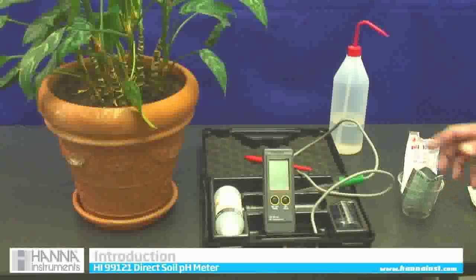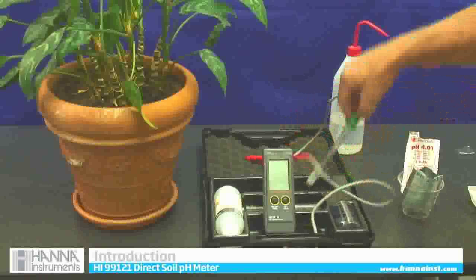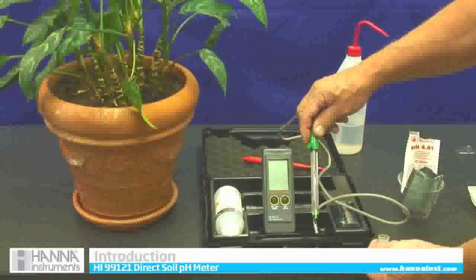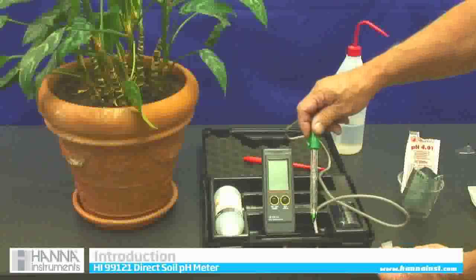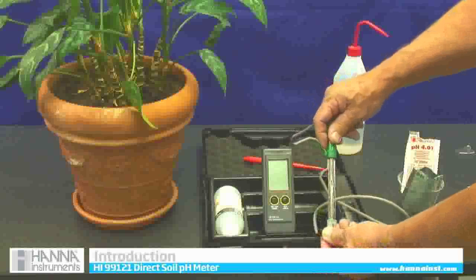It comes in a kit as we can see here. Here's our meter, which comes with a probe. The probe is glass — we make it out of glass on purpose so it is extremely accurate and fast responding, but you have to be careful because it is fragile. It has a nice glass probe.